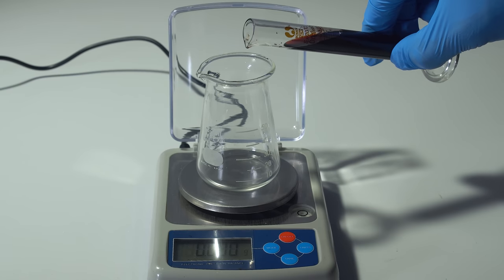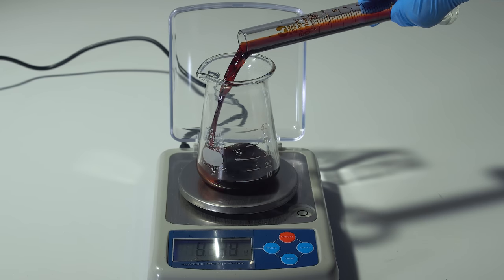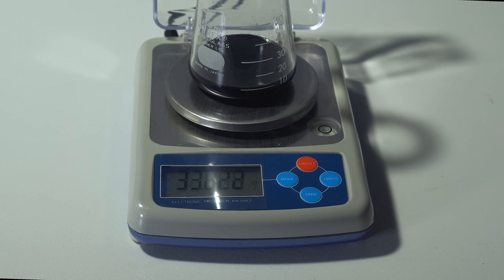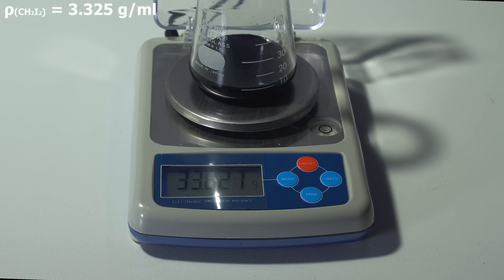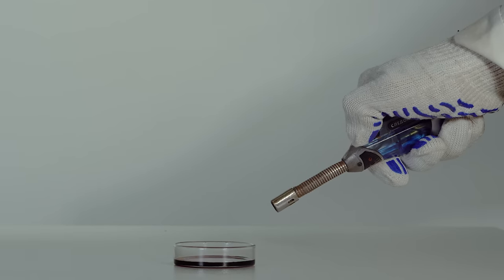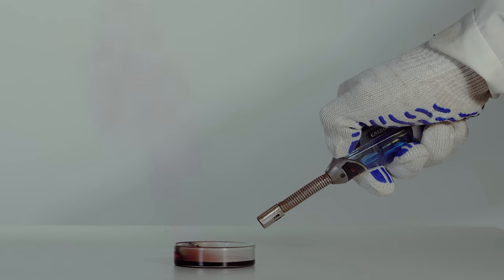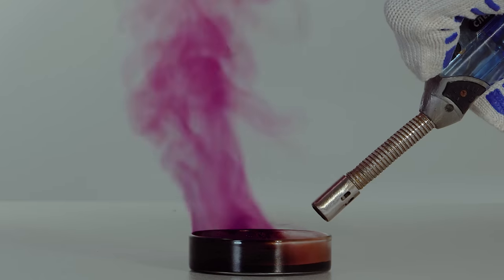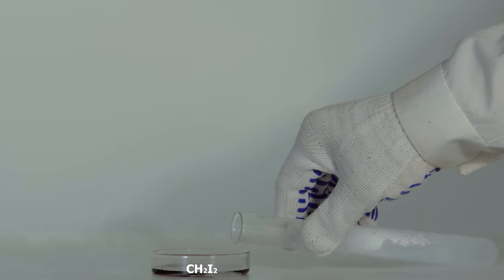This dark liquid, that ideally must be slightly yellow, is methylene iodide. It is the heaviest organic liquid with a density of more than 3.3 grams per milliliter. Under ordinary conditions, setting it on fire is impossible. This liquid is 95% iodine. However, mixing it with liquid oxygen causes combustion with a profuse emission of iodine.